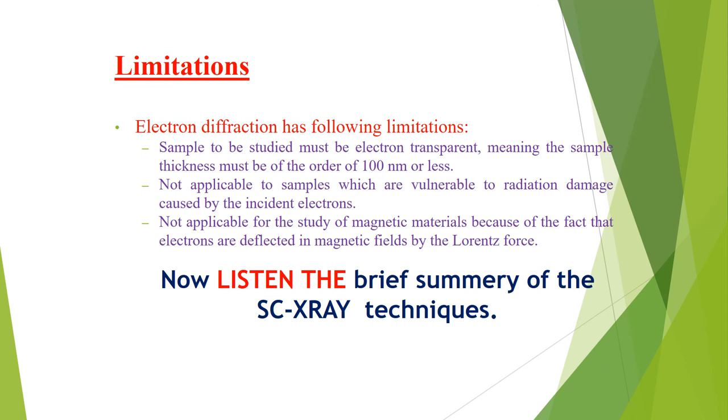The design challenge for single crystal diffractometers is how to determine the position and intensity of these diffraction spots. Laue versus single crystal diffraction. In the Laue method, a stationary sample is bombarded with white radiation, that is, many wavelengths. But in single crystal diffraction, monochromatic radiation hits a sample that is rotated and manipulated to bring different planes into diffracting condition.